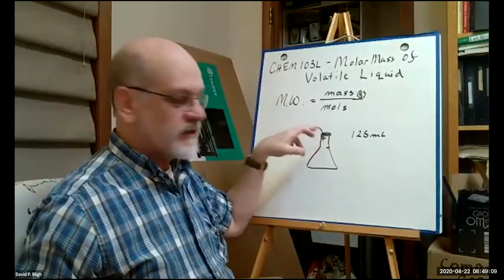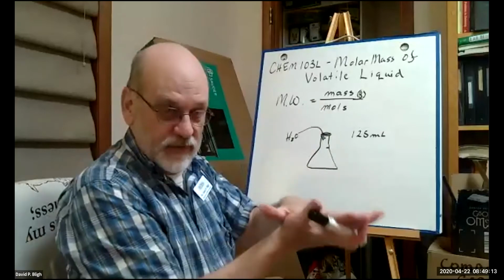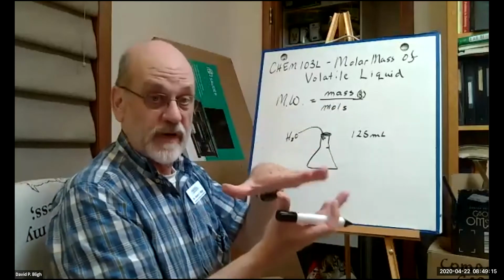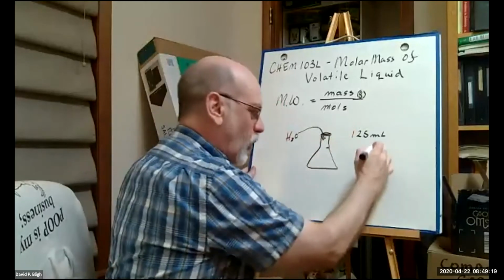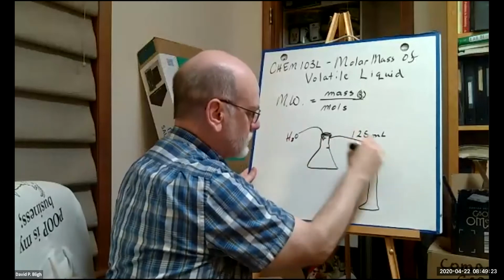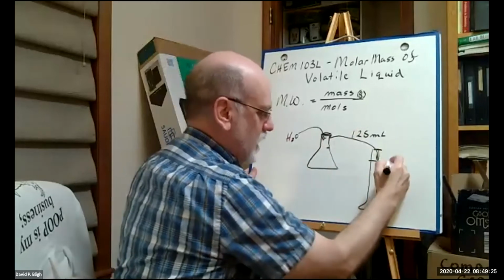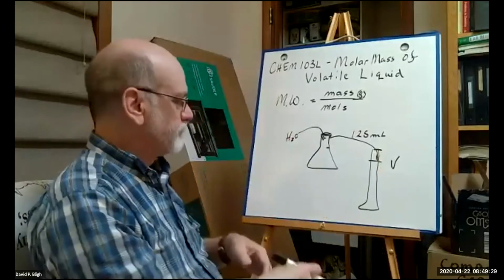You want the position of the water there to be at the same level as the cap that you're going to put on it. And I'll describe the cap in a moment. So once you fill it up, then you pour it into your graduated cylinder. Right? And there's your volume. Just measure the volume of the water.